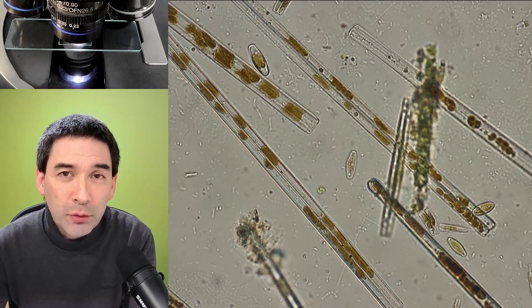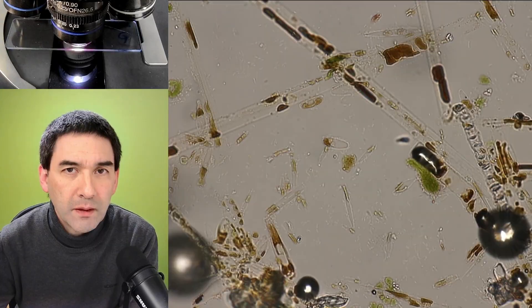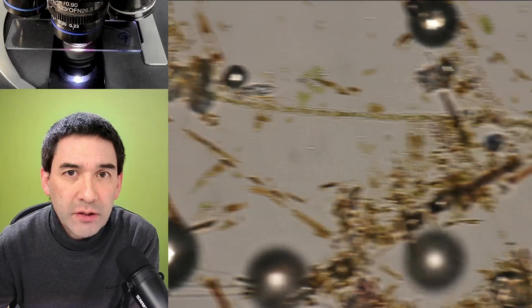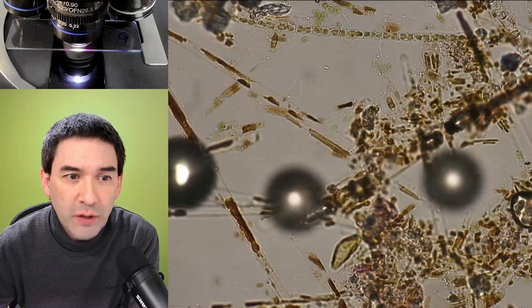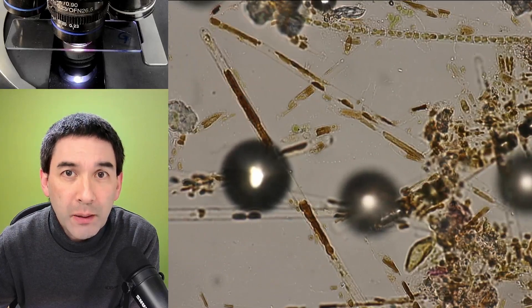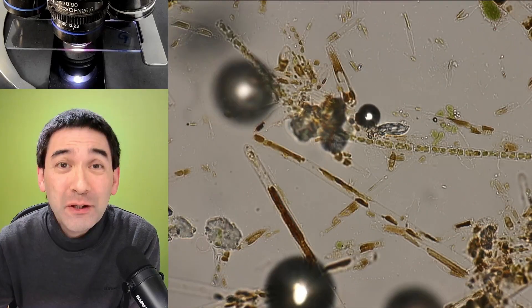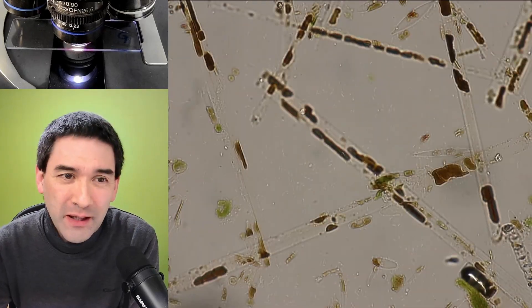I'm going to now show you the slide mounted in glycerin gelatin. This here is now the slide mounted in glycerin gelatin. We see that those round structures here are bubbles. Glycerin gelatin is notorious because bubbles are difficult to avoid, so you have to be kind of careful when you make them.